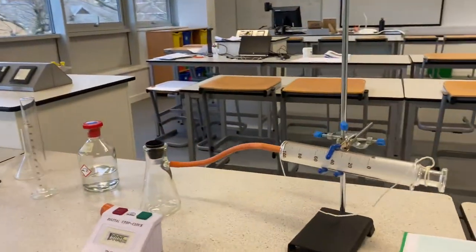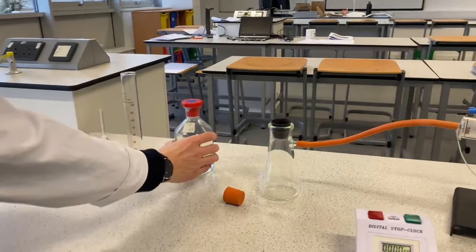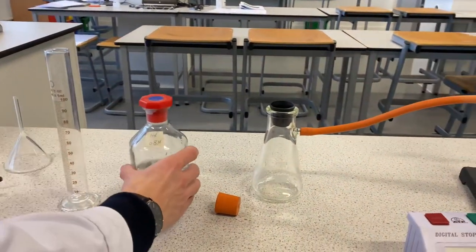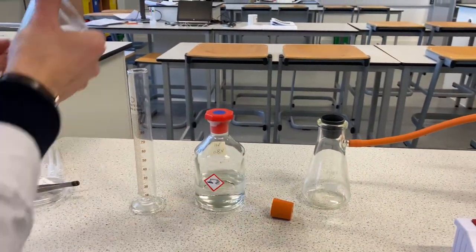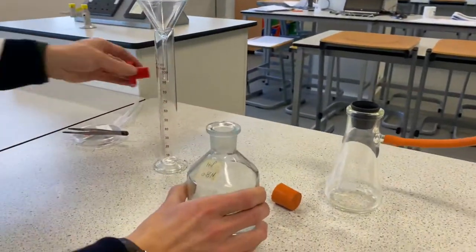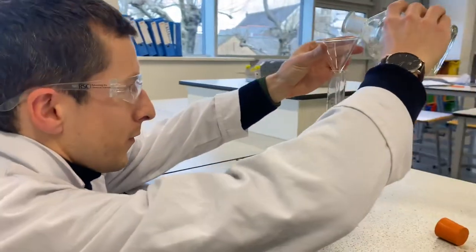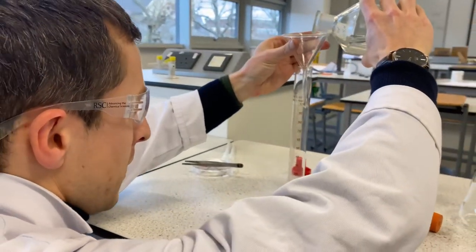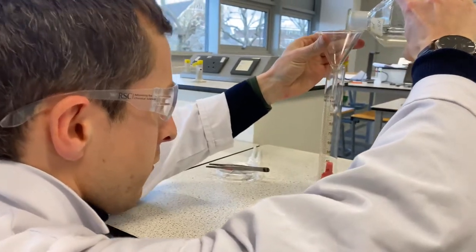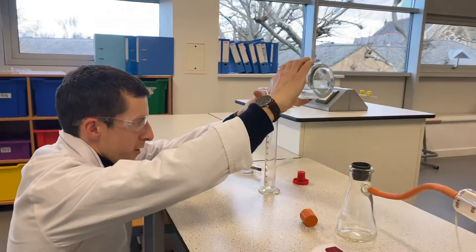Tell us, what do we start with? Okay, talking through the experiment, we're going to put some hydrochloric acid — we're going to measure out 50 centimetres cubed into this measuring cylinder. I'm going to use a funnel to be safe, and I'm wearing my lab glasses as well. So I'm going to get down to eye level. I'm going to measure out quite confidently up to around 40 or 45.